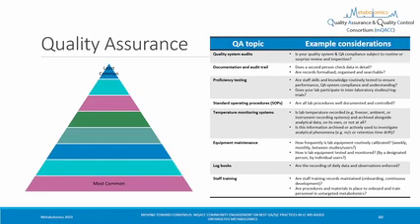I can very well assure you that one person in one lab with one instrument can produce quality that is of a very high standard, and they could even do it reproducibly, right? So this isn't to say that unless you have quality system audits operating monthly, you shouldn't be trusted to produce high quality data. That's not the point. The point is really, I think, more of scale.